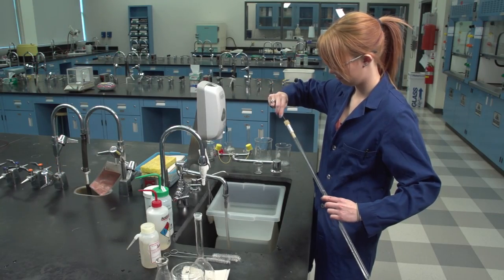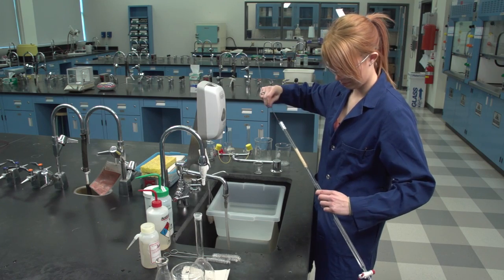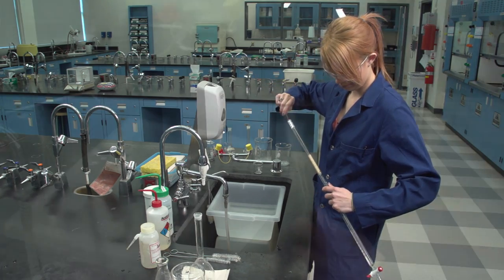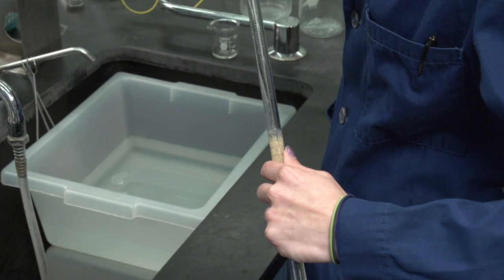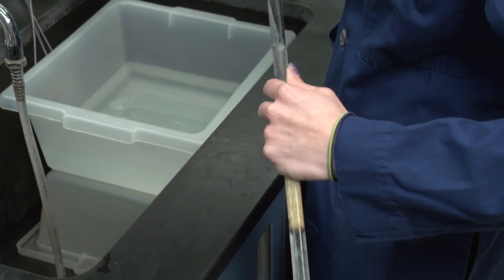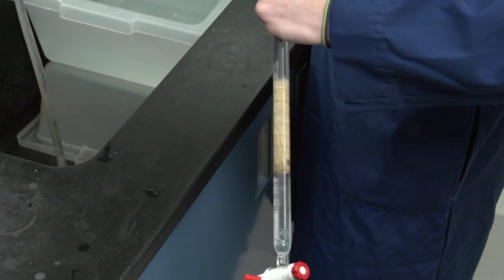Volumetric glassware such as pipettes, burettes, and volumetric flasks should not be scrubbed with ordinary brushes as they tend to scratch the glass and can change the calibration. Special brushes are available for this purpose.